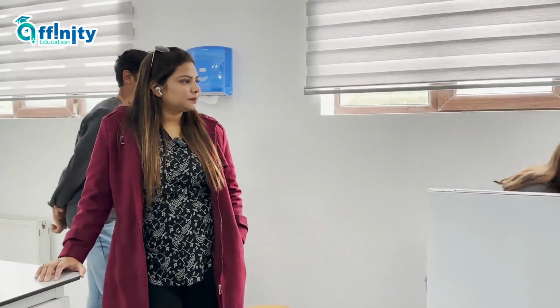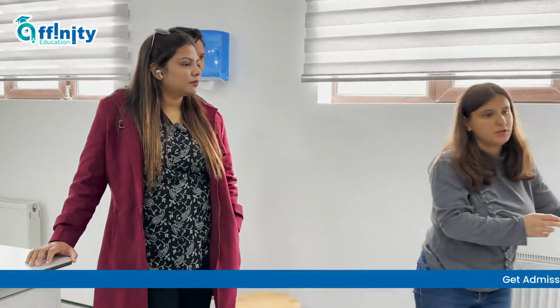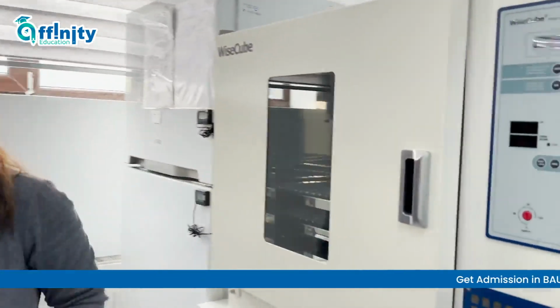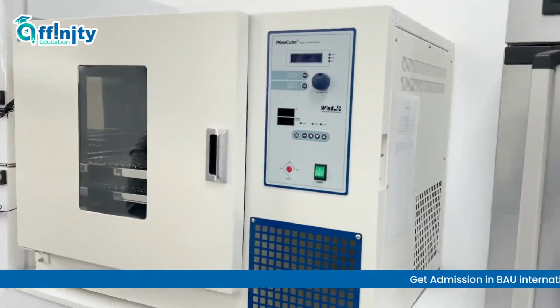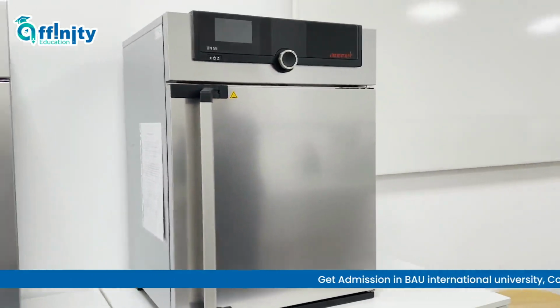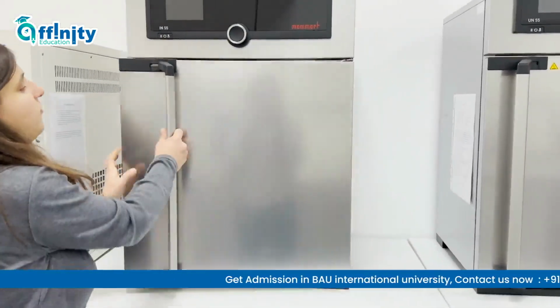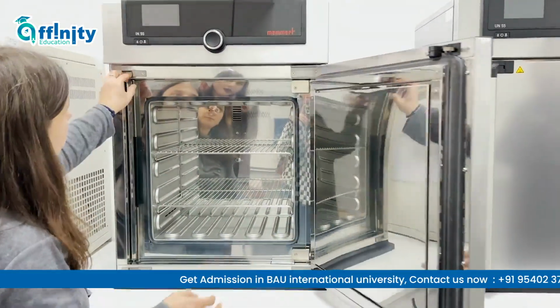Okay. For the specific instrument conditions and etc. This is for microbiology. Here it's kind of equipment here. And what is that? Incubation. This is for microbes incubation.